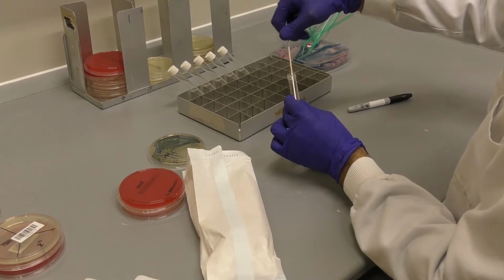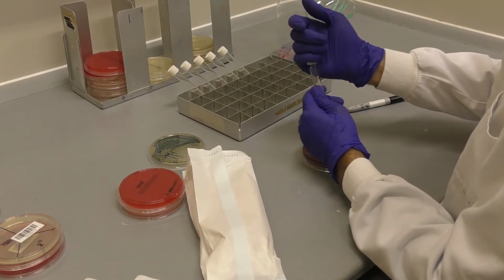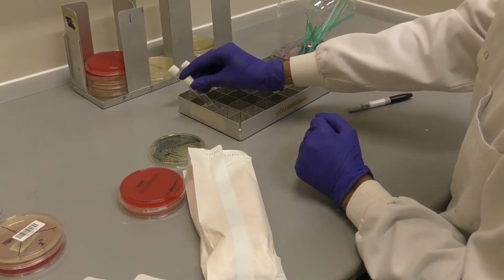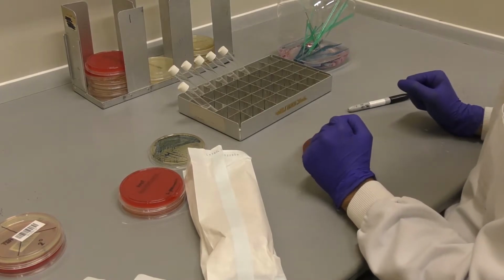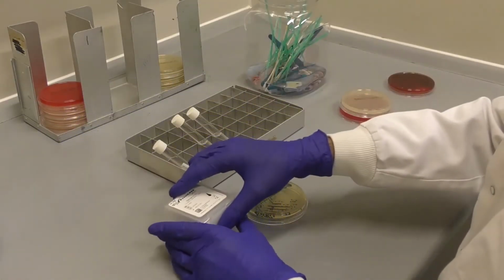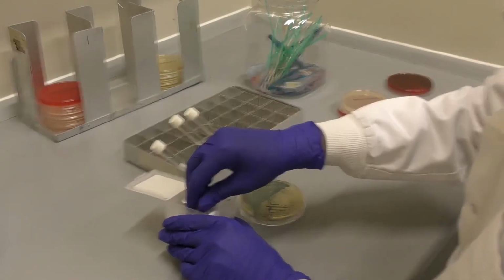If not, make up a fresh suspension. Make your suspensions by suspending colonies in saline using either a cotton swab or sterile loop. When making your suspensions, use 2 to 3 morphologically similar colonies to avoid atypical variants, and mix the suspension by inversion. You'll now need to standardise your suspension to a density of 0.5 McFarland standard using the McFarland equivalence turbidity standard set.